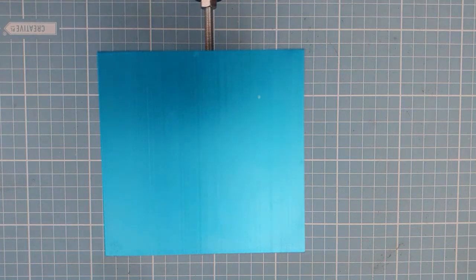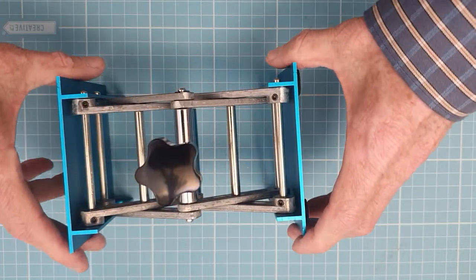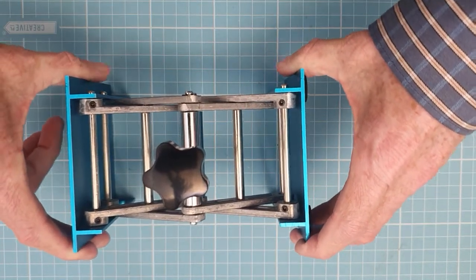It has a multitude of uses in the laboratory and elsewhere. I use it as a platform under my stereo microscope to adjust the height of various items. It's reasonably solid and robust, though it does wobble slightly.